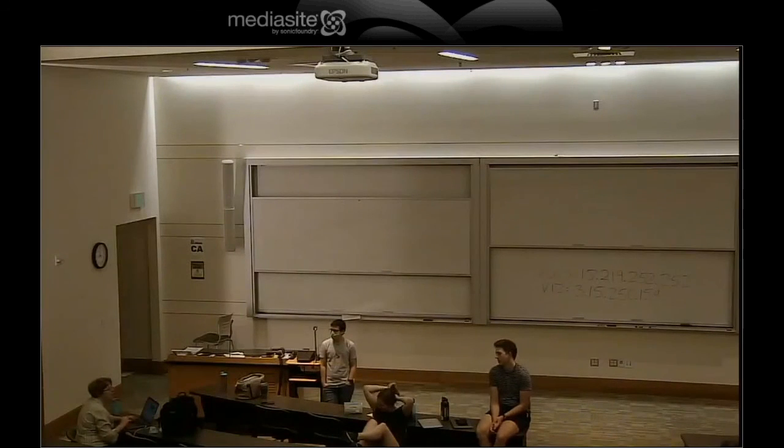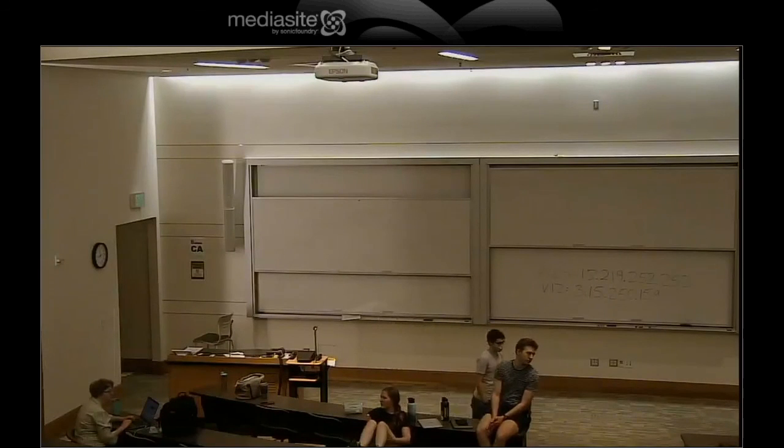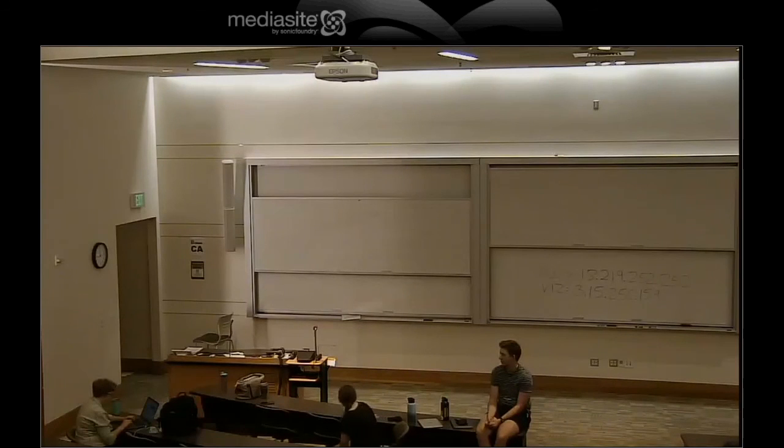I still use the P value because I got some really good results on it. And they're throwing it away because they throw away things that are below the low expression cutoff. And yet, it still gives beautiful results, which means their low expression cutoff is probably too strict. The pathway is up as long as you have a high enough expression.